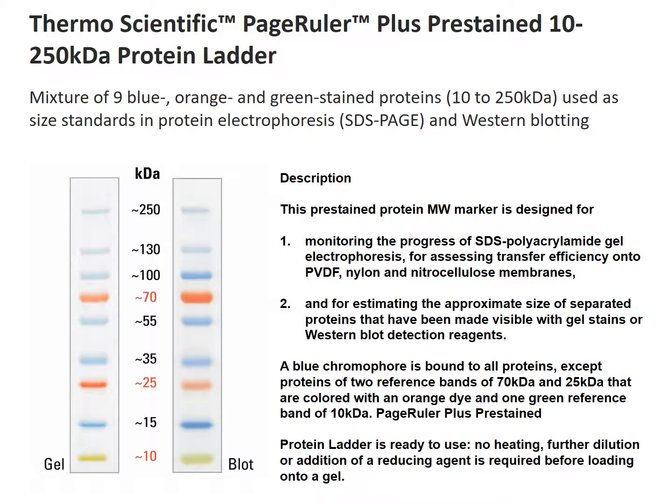And so when you run the electrophoresis, the standard should separate as shown in the company's document here. And so when you blot it, these should go and be on the blot. So here's the blot. So if I put it in opposite, then it won't be on the blot. It would be in the buffer.